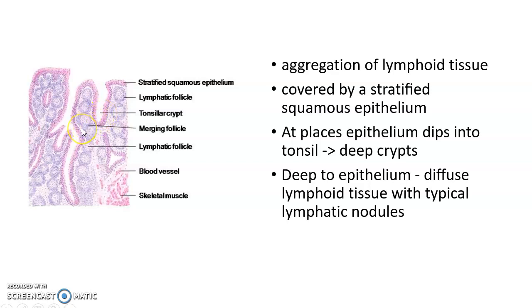Deep to the epithelium there will be diffuse lymphoid tissue with typical lymphatic nodules. This is a lymphatic nodule or lymphatic follicle. It has a germinal center surrounded by lymphocytes.